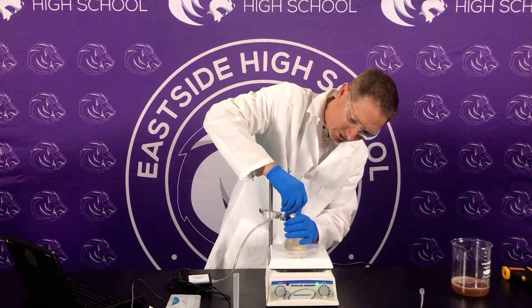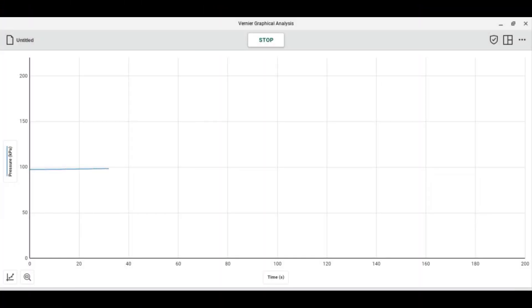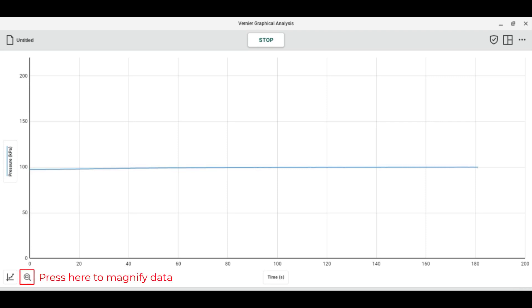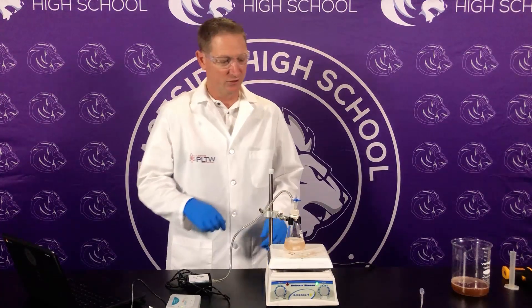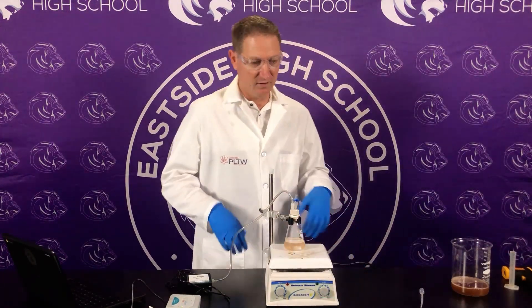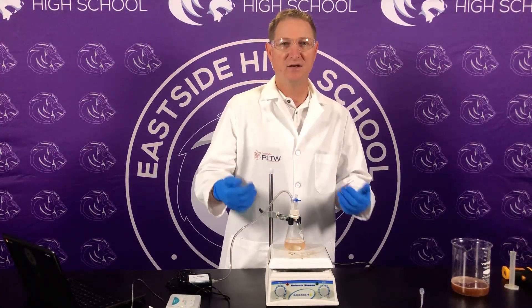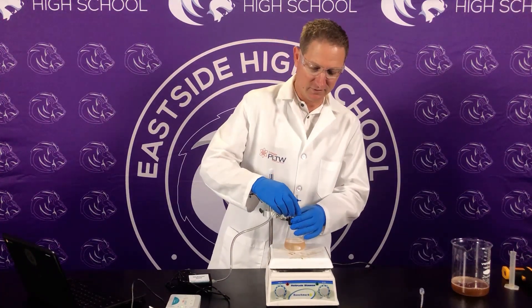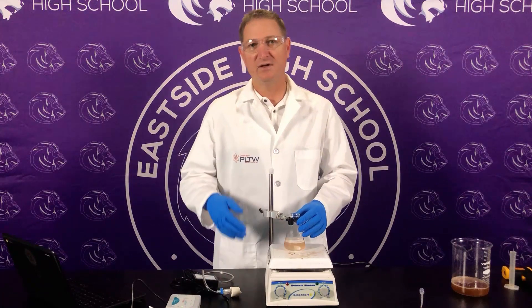Really quickly, put it on, secure it as much as possible, and hit collect. And there we are — 200 seconds. I'm going to go ahead and stop this. Now for this lab, we're going to make sure that everything is consistent. We're going to check the temperature and make sure that we use the same catalase and the same equipment all across the board. Gently release the pressure — there's not much in here. And that's your baseline test.